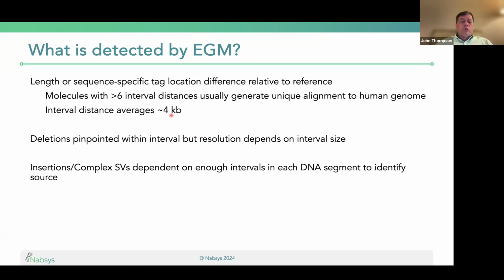The resolution on distance is much smaller, so that you will know that there is say a 500 base pair insertion or a 500 base pair deletion within this, and know the size of the structural variant much more precisely. It'll be within a few hundred bases, as opposed to the resolution of exactly where it is. So there's some uncertainty here, but it provides a much broader range of measurements than you can get with any other technology.